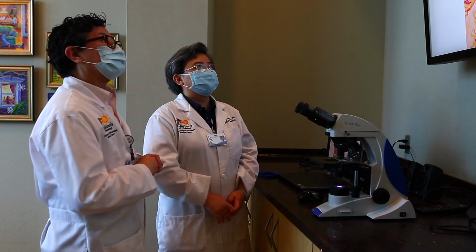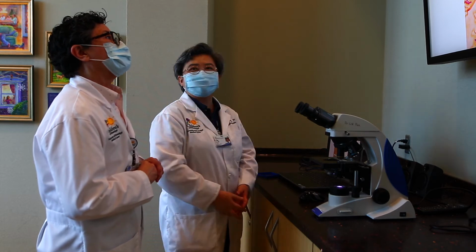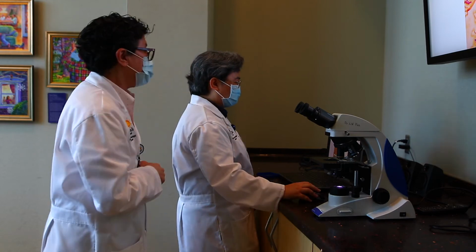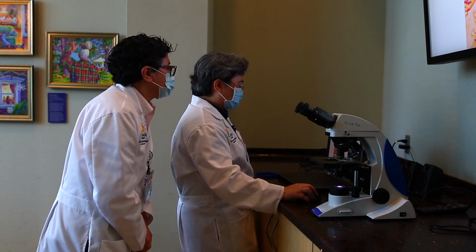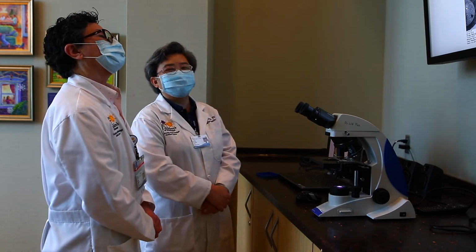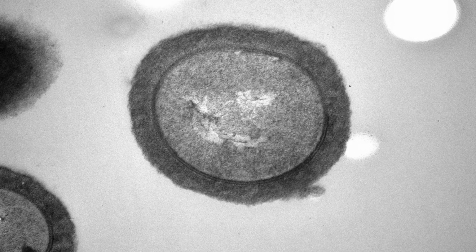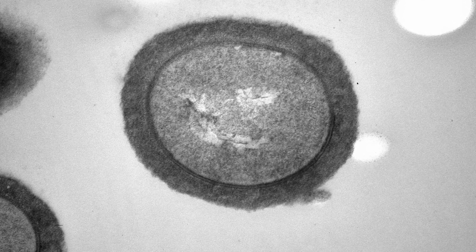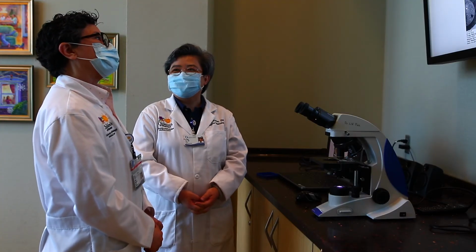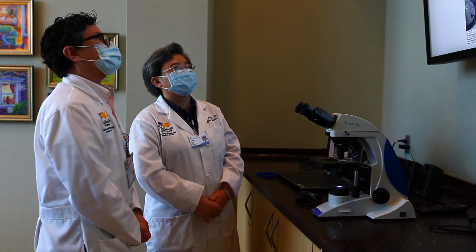Yes, that's right. So, do you want to see the small size? Oh, that tiny small one that is there? Yes, I would like to see them. Alright, I just got the picture transferred from Dr. Mary McCall. You can see the detail of the bacteria. Oh, and that is a more powerful microscope? Yes, that's right. What is it called? It's called the electron microscope. So you can see a bigger detail. Yes, that's right. This is so interesting.